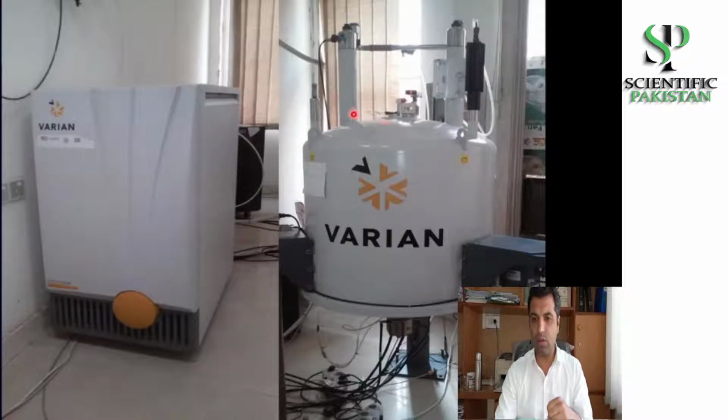The inner core, these two whites, they are for filling liquid helium. So the inner core is filled with helium to keep the superconducting magnet at a very low temperature, to keep it as a superconducting magnet. And the outer core is filled with liquid nitrogen, and that is to keep liquid helium in liquid state, right?